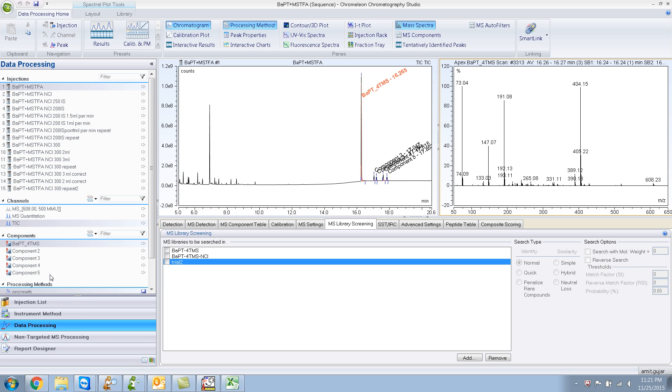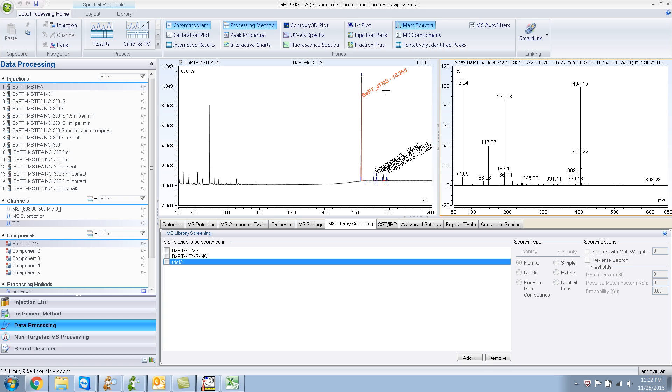For example, in this case, I have this particular compound called BAPT-4TMS. It's benzene apyrene tetrol, the 4TMS derivative. And this particular compound is not present in any of the libraries that I have.